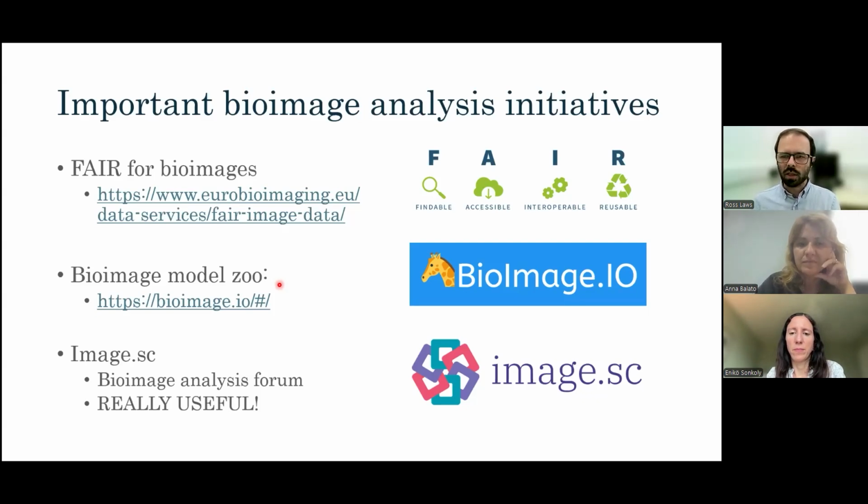But with some of the new deep learning workflows, we can more effectively train the AI models to segment out the features of interest with not an enormous amount of training data. So basically, that's the plan, to bring people into the facility, to make it so that we have a workflow from start to finish where they can not just get images out at the end, but get data out at the end as well that they can then publish alongside their other techniques that they've used. I hope that answers the question.